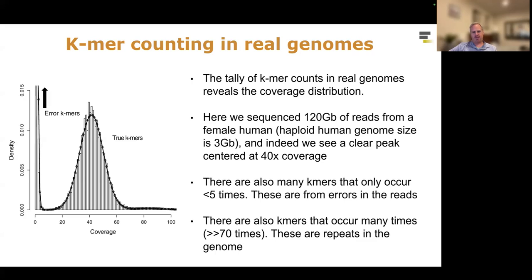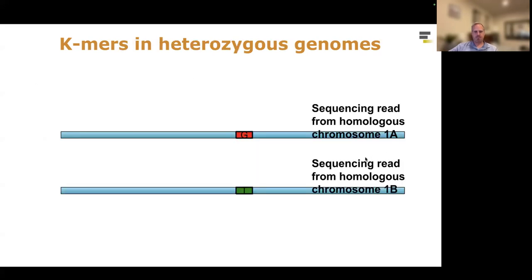Typically, when you do an analysis like this, you'll be looking at k-mers that are 21 or 25 nucleotides long. So those individual sequences may occur many thousands of times across the genome. Again, if you think back to that Dickens analogy, those repetitive k-mers will form all of the cycles, all of the loops in the graph, where all the challenges will fall that we'll need to address.